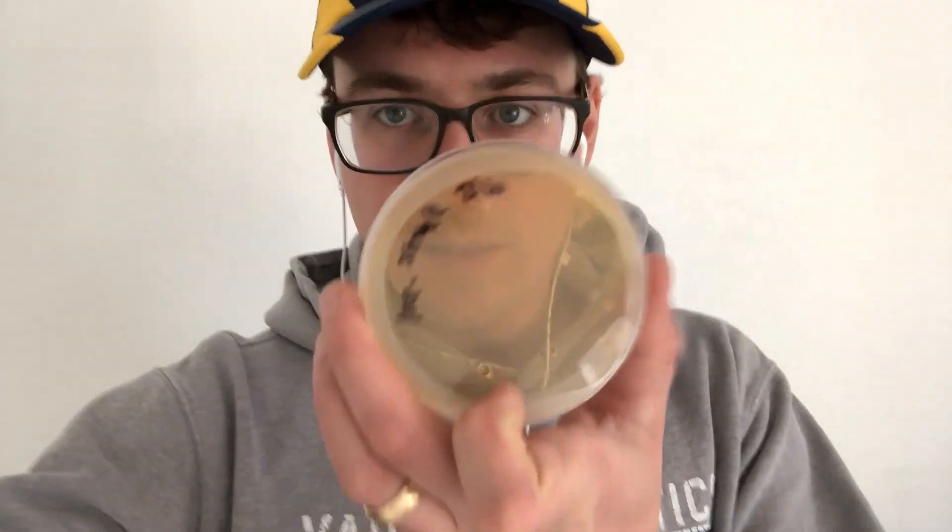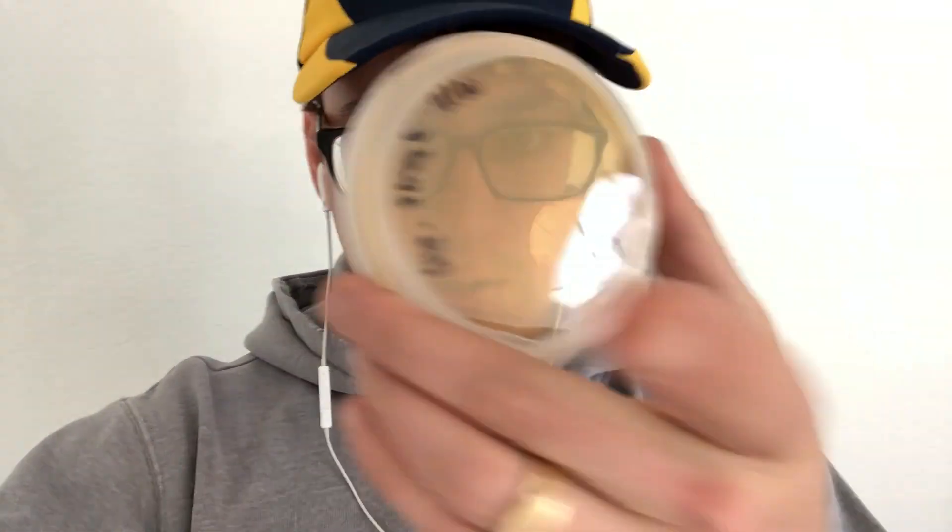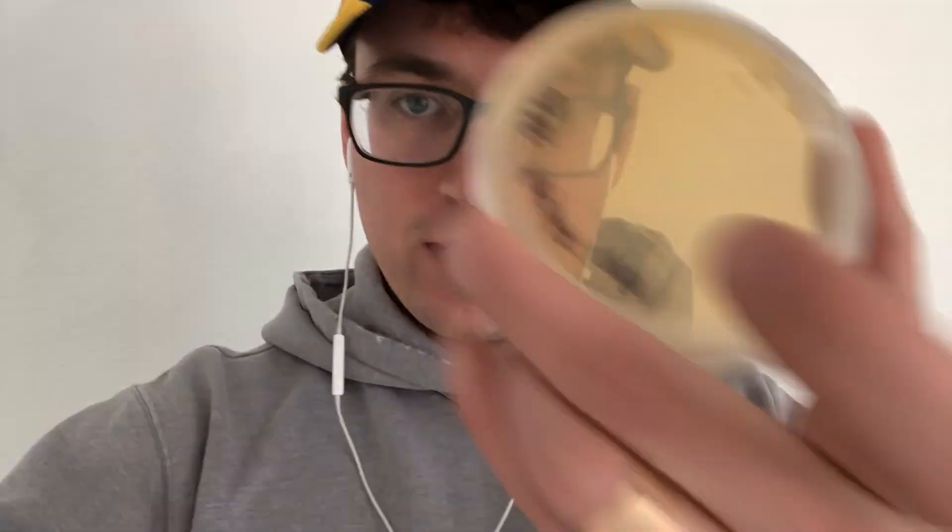Hey guys, what's up, it's Gary with Fresh from the Farm Fungi. I'm here in Denver and it's been two weeks since we inoculated our spores, and we finally got some pioppino starting to form. There's maybe 10 isolates of pioppino from the streak plate. The other two plates are still clean, but I can definitely work with 10.